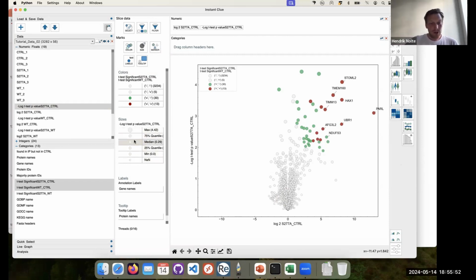For numeric data we get a different legend, and this usually covers the same metrics that we also have in the box plot, which we explored already: the quantile, the median, the maximum, and so on.